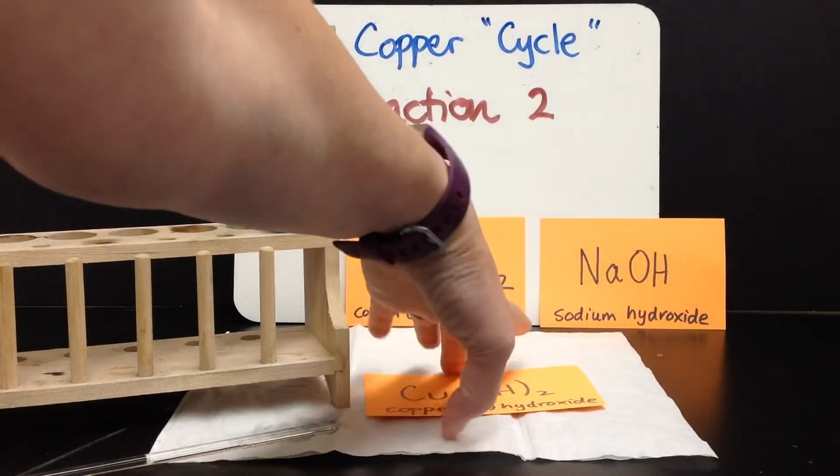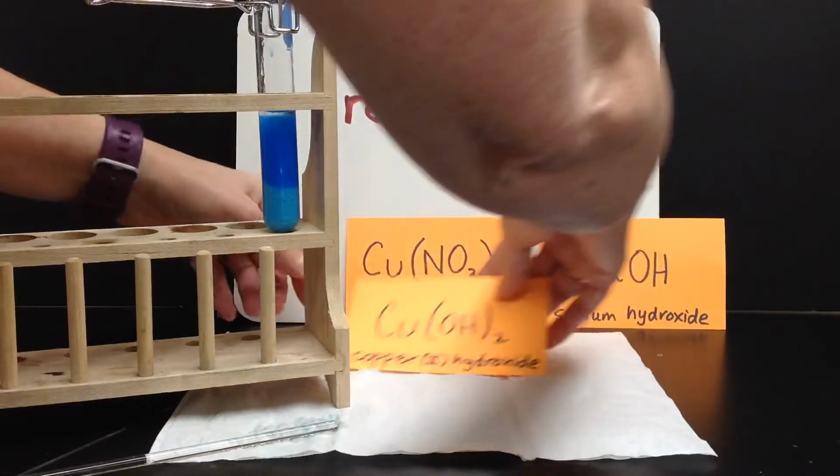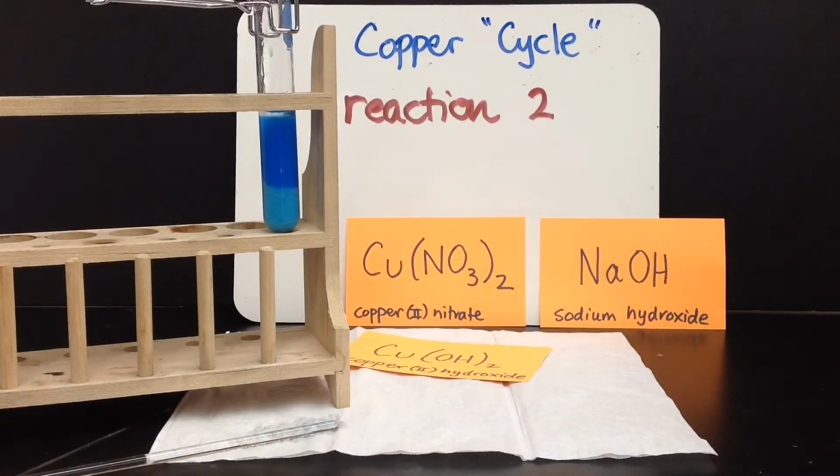I don't know if that helps me to lay them down or anything. That's not going to help in the slightest bit. I'm going to have to figure out a better way to do this. And I'll lift them up in a second.